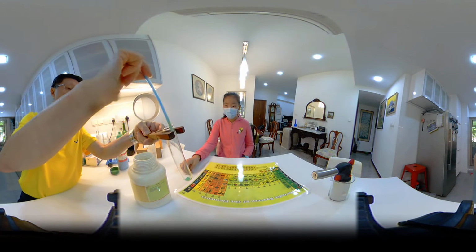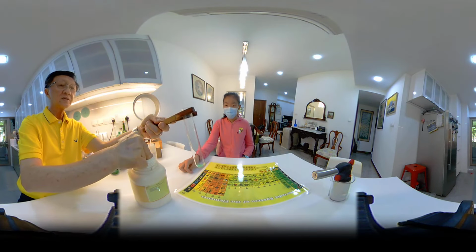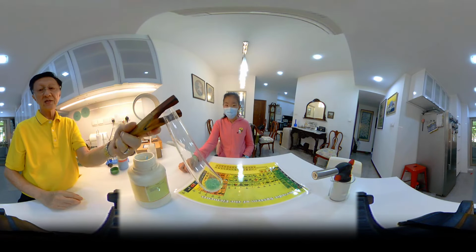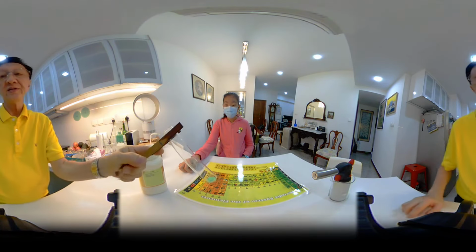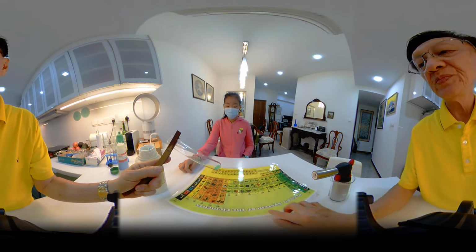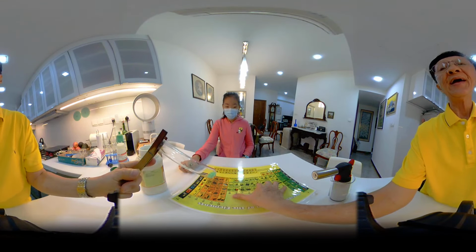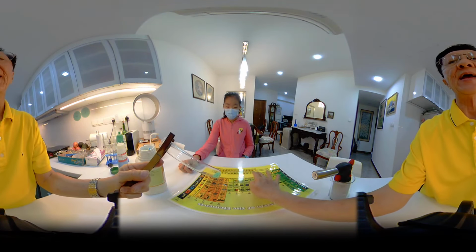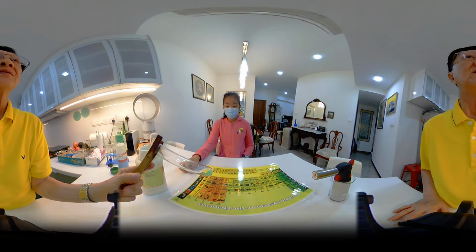Can you see the compound is green in color? In fact, nickel falls within the periodic table in this section, and this section is known as what kind of metal?